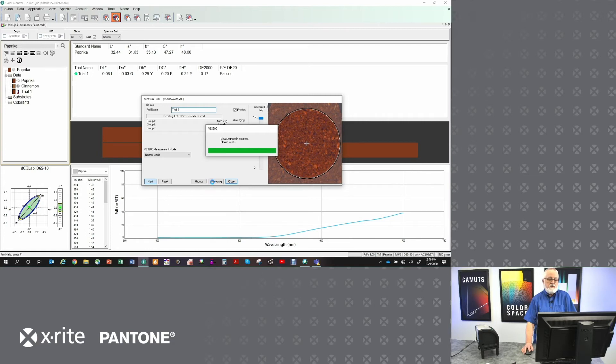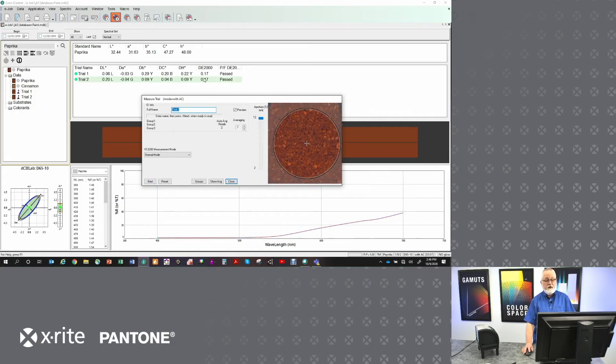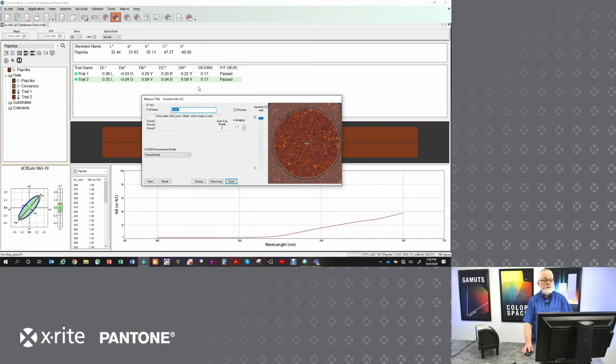But when it's done, I'm going to get color difference very similar to the previous measurement. They're both 0.17 Delta E 2000 away from the color standard.